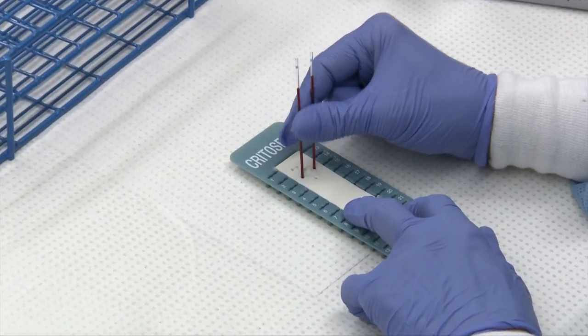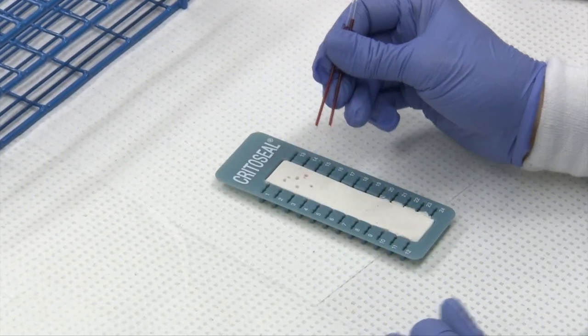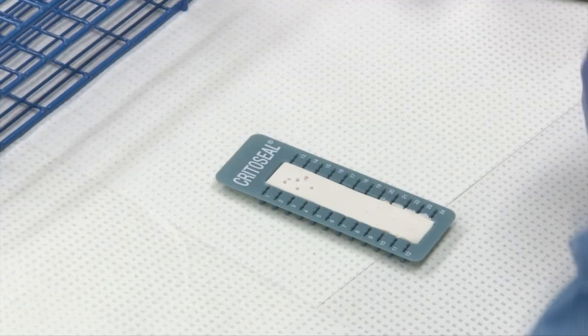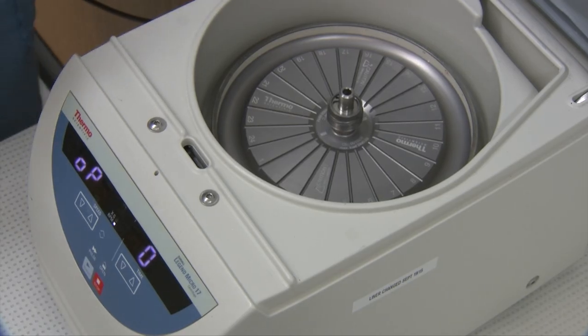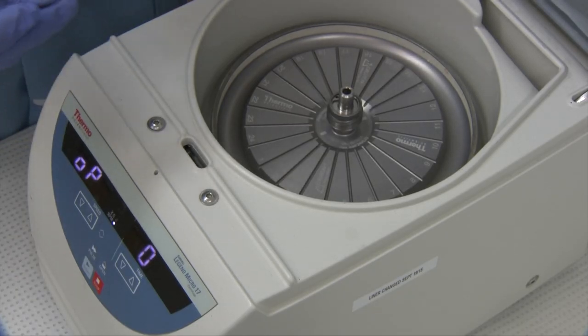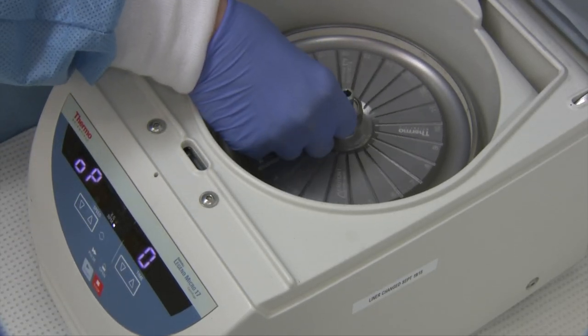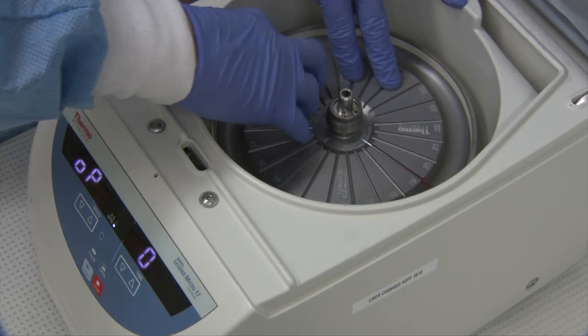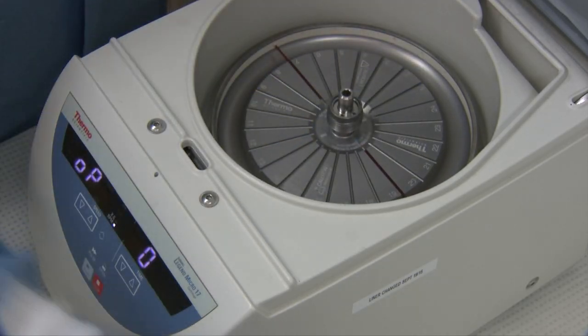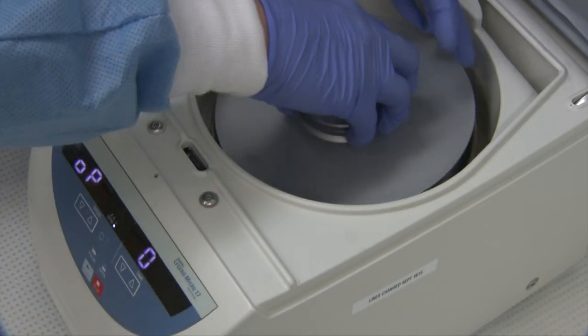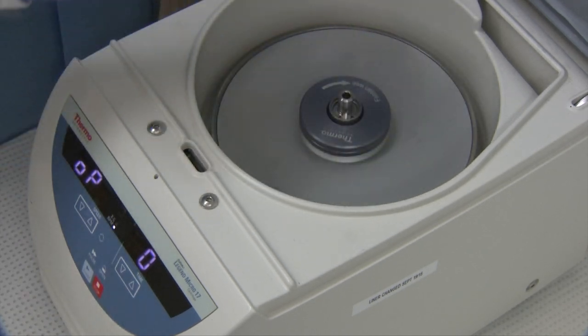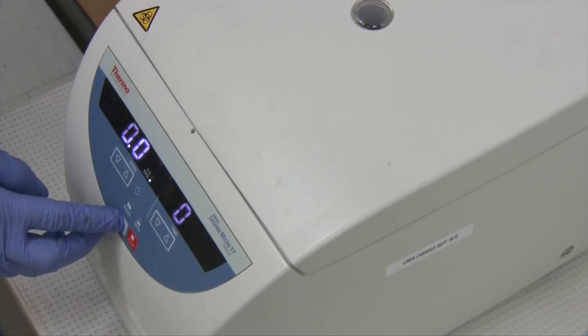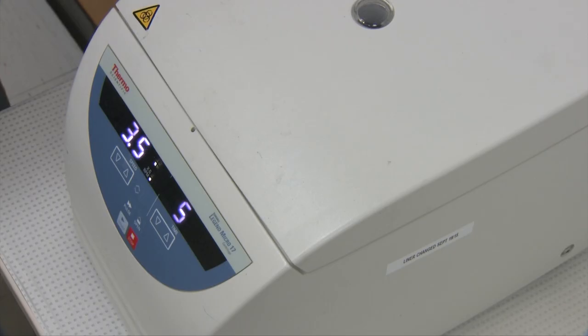I'm going to go over to our microhematocrit centrifuge. The reason I've spun two tubes is you may need two tubes of plasma for your refractometer protein. You want to make sure that your sealant is to the outside ring. If that doesn't happen, you are going to end up with a bloody glassy mess. Put them across from one another so the centrifuge is balanced. This one spins for five minutes at 13,300 rpm.